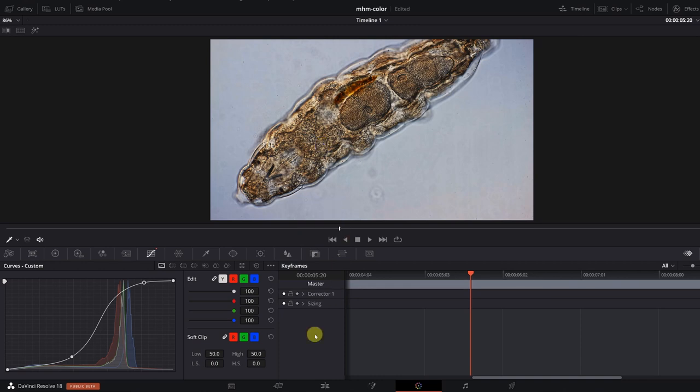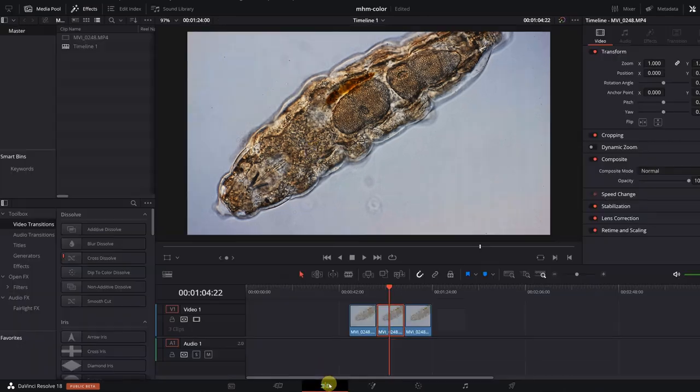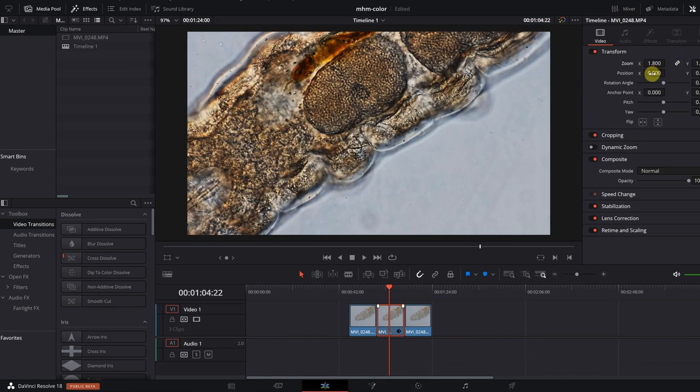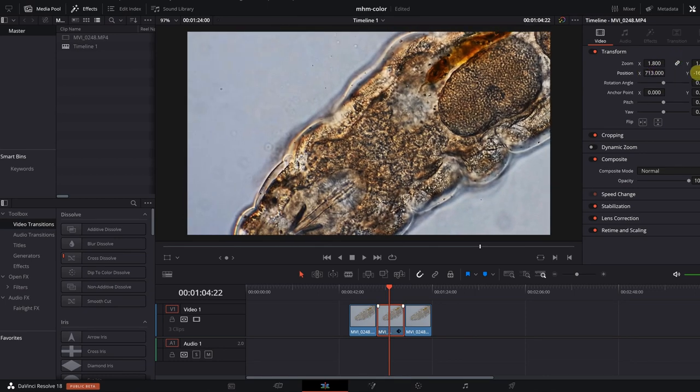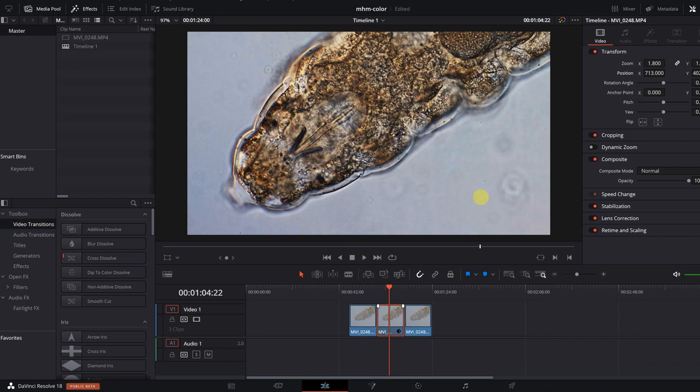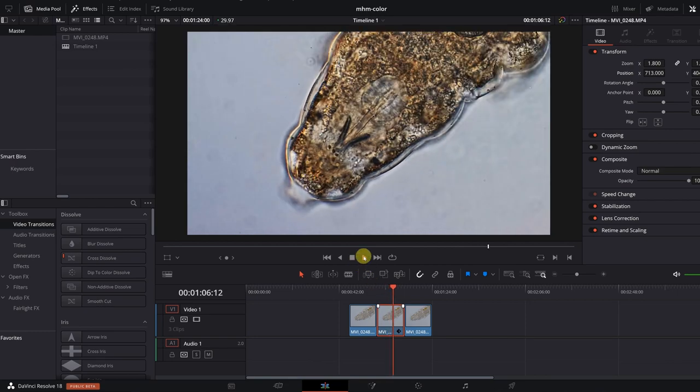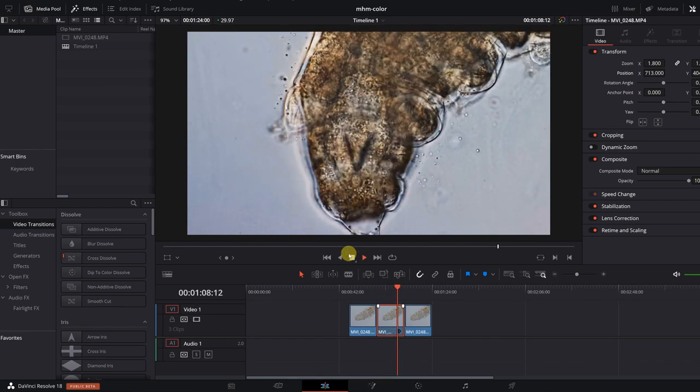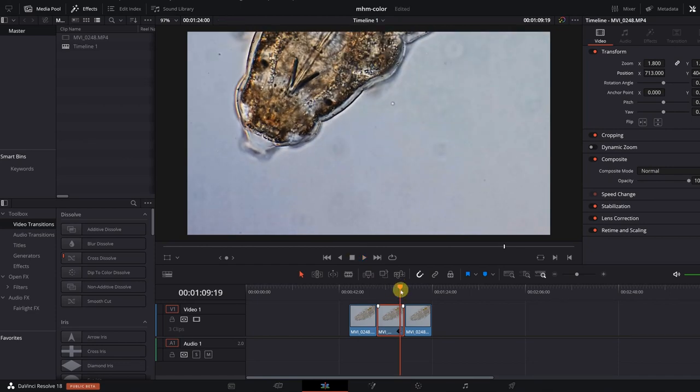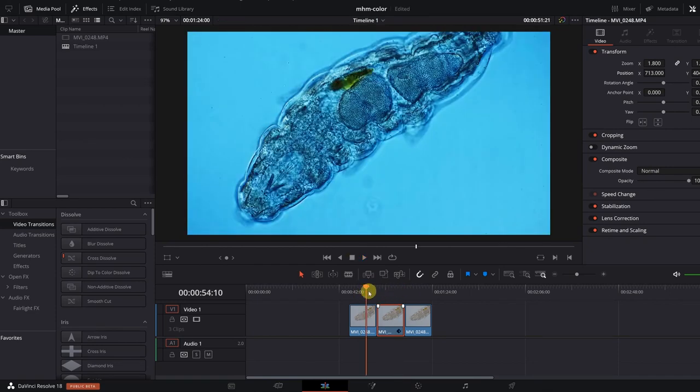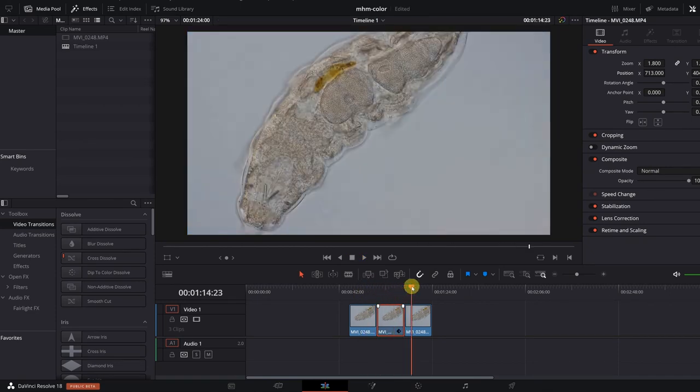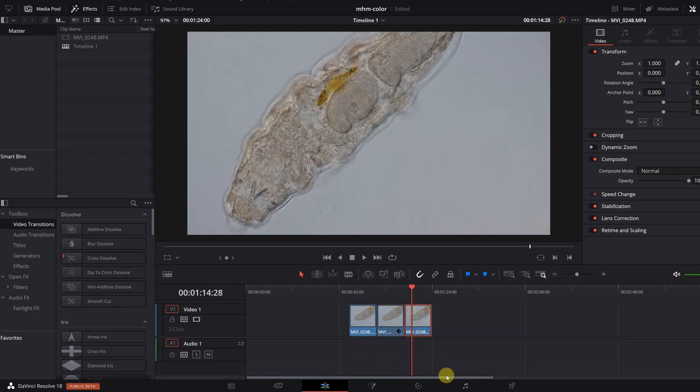I'm going to show you also another thing here, because when I switch over back into the edit tab, I can now actually also zoom in and I can reposition and recenter everything. That's quite an easy way, and this basically makes it larger again. This kind of, even though using the same footage, you're essentially adding a totally new quality to the video.